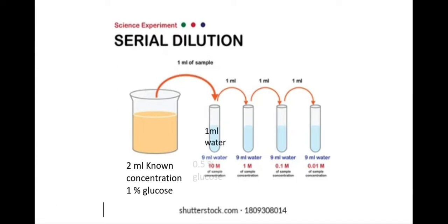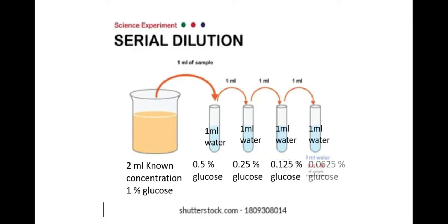I add one mill of water and this dilutes my one percent to 0.5 percent glucose. If I do the same again, take one mill out, put it in the next test tube, add one mill of water, that becomes 0.25. If I carry on during this process, eventually I'll get five total different concentrations due to halving the concentration each time, diluting it with water. So the first thing I do is a serial dilution.